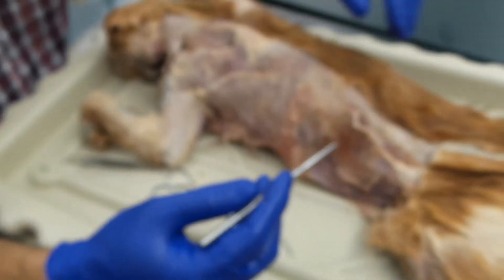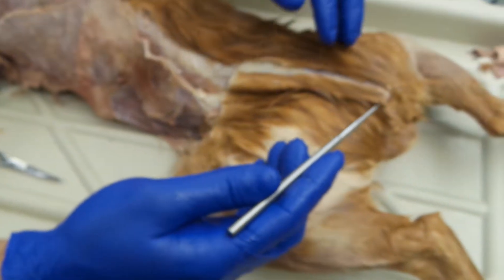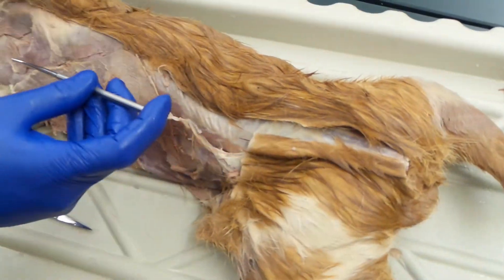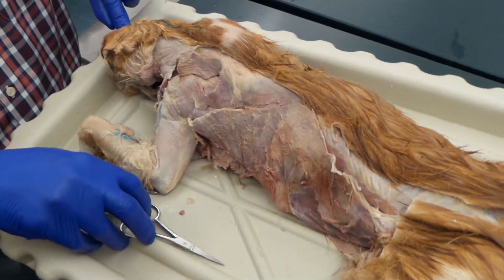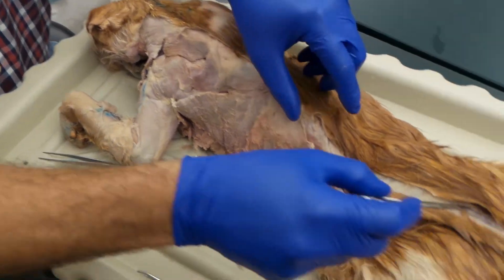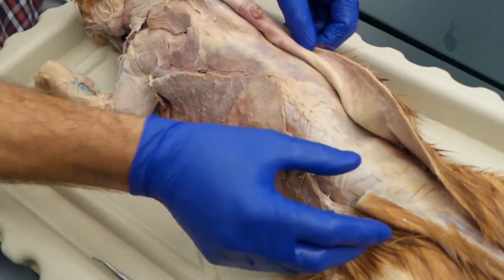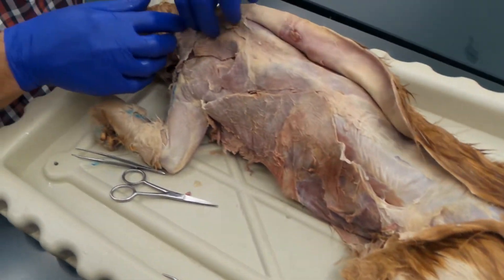I'm going to show you how to do day one's dissection. First thing you want to do is remove the tail. Then you want to come in with your probe and lift the skin the whole way up to the head, right about between the ears. Cut along so that we can work that skin back. You can see it's already kind of pulled down on the left-hand side.